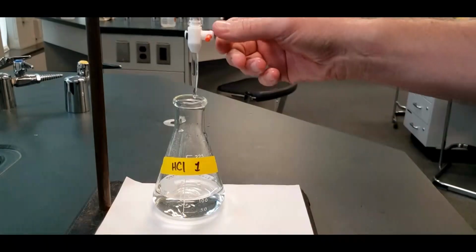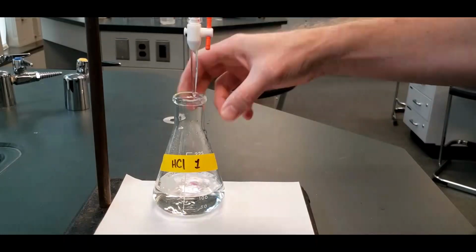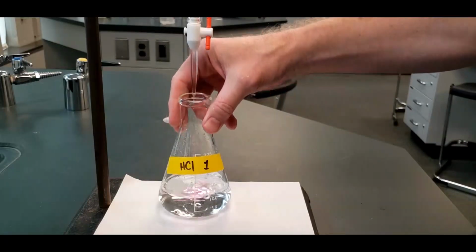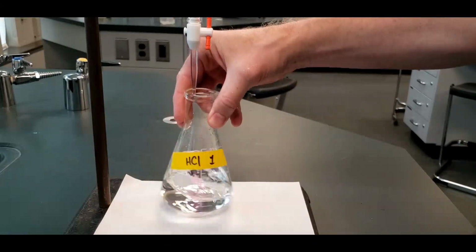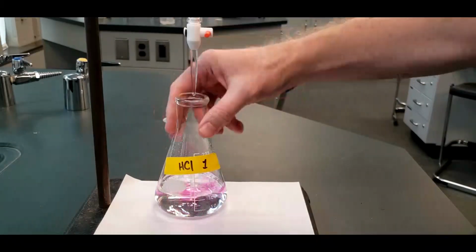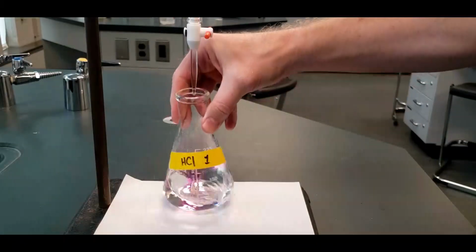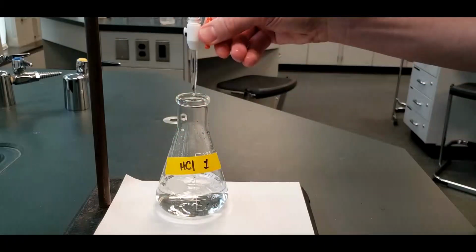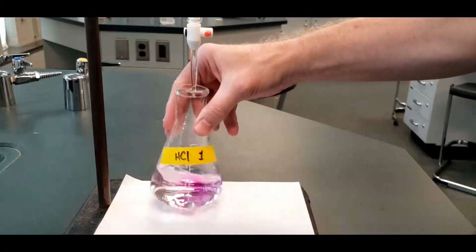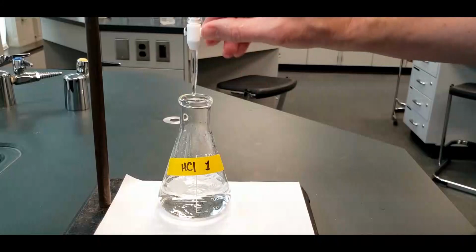Okay, we joined this titration in progress, and you'll be glad that you did because we're already to 30 mils, and it's taking a while. This is the unknown HCl. I have no idea what it is. It's not going to be like 10 molar or anything, but it can be pretty high. So, closing in. All right, so this one now let's be careful.